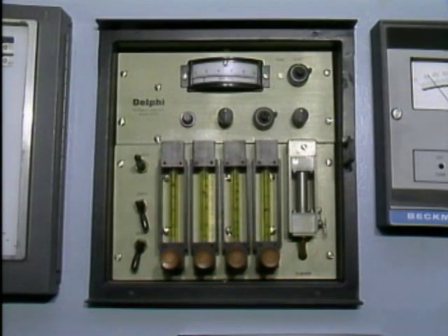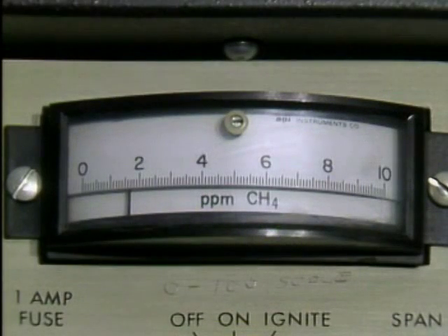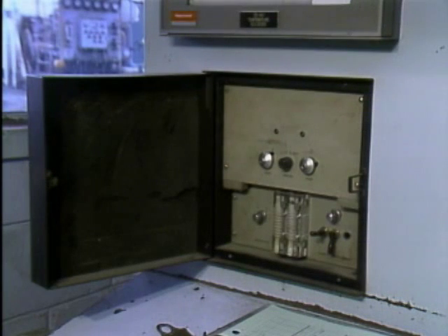Often it's necessary to monitor the concentrations of gases other than oxygen in a gas mixture. For example, many plants measure the concentration of a specific gas in a binary gas mixture, which is a mixture of two gases. An analyzer that's commonly used for this purpose is a thermal conductivity gas analyzer. Thermal conductivity is the ability of a substance, such as a gas, to conduct heat. The operation of a thermal conductivity gas analyzer is based on the fact that different gases have different rates of thermal conductivity. Argon, for instance, has a lower thermal conductivity rating than nitrogen.